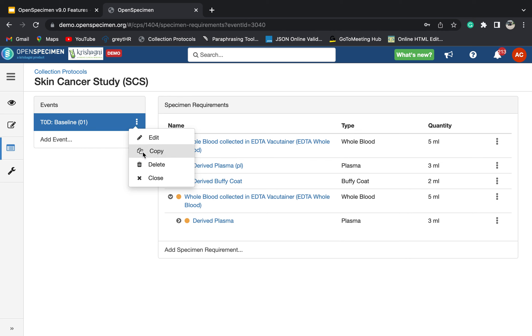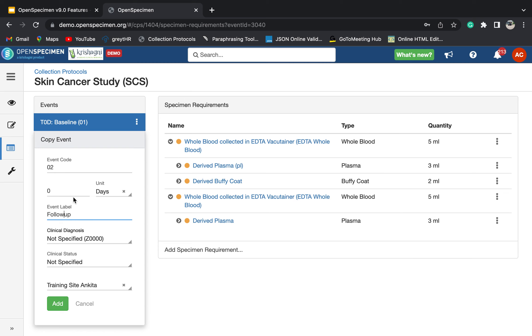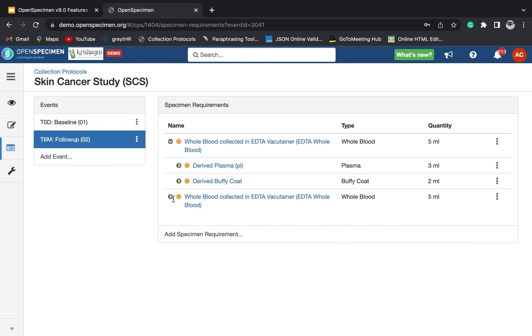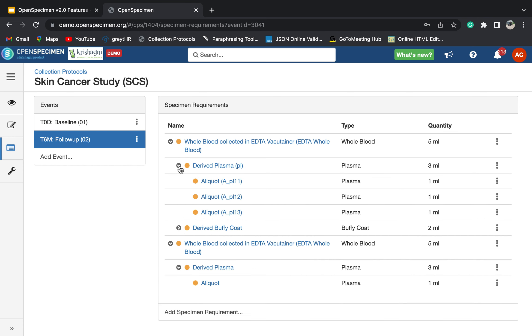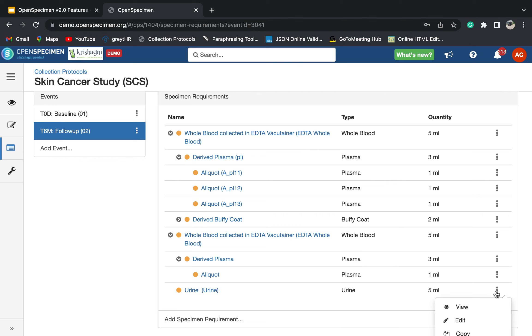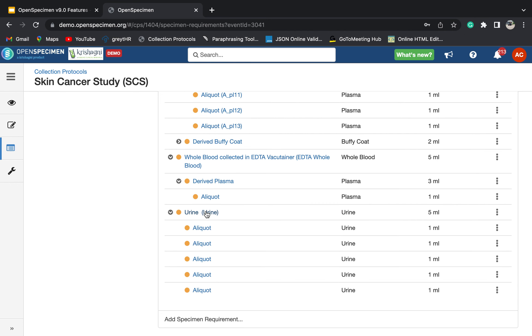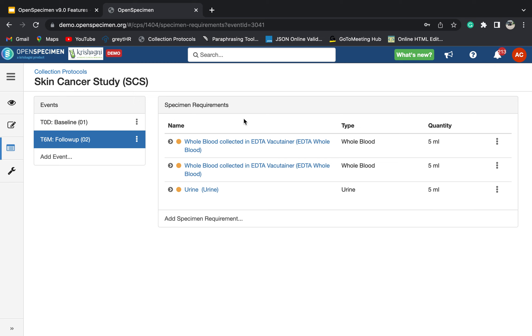Now let me show you the copy event feature. If you click copy, everything will come over — but since event code and label must be unique, you can update those. For example, set the label to follow-up and the event point to six months, then click add. As you can see, everything is copied from parent to child. If you are also collecting one more specimen, you can add that and click create.